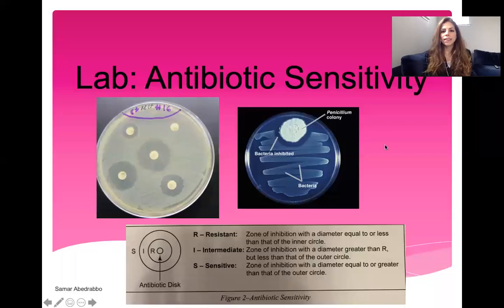Hi everyone, this is the Antibiotic Sensitivity lab. In this lab, you're going to learn how to test if bacteria are resistant to different antibiotics or if they're sensitive. Sensitive means that the antibiotic actually works. And I think this is a very cool lab because it is actually used in clinical settings when someone has an infection.